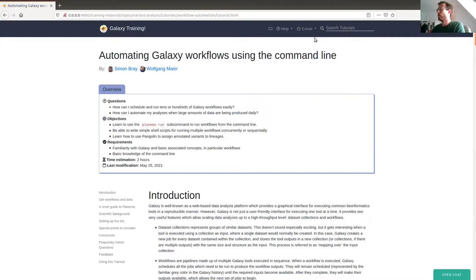Welcome to this tutorial on automating Galaxy workflows using the command line. The aim is to demonstrate the functionality which Galaxy provides for running workflows not just in the graphical interface, which you should already be familiar with, but also using the command line. So if you've ever had to deal with analyses which require you to execute not just one or two workflows but tens or hundreds or even thousands, then this tutorial should be interesting for you.